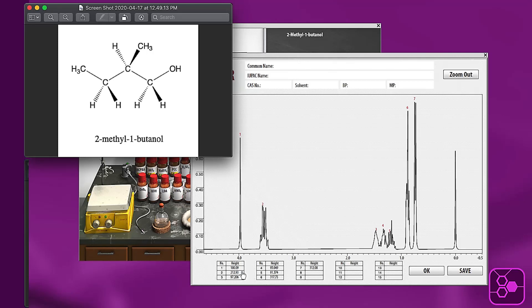So peak two is about 200, about two times 100. So that peak likely corresponds to two protons. Peaks three, four, and five are also near 100 in their heights, and so those you could each quantify as being one proton. And you can see that peaks six and seven are both around 300 and likely correspond to three protons each.